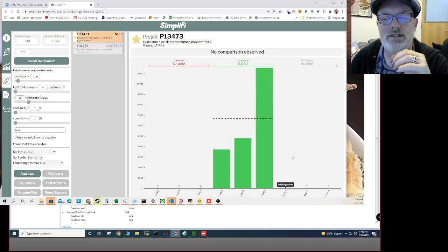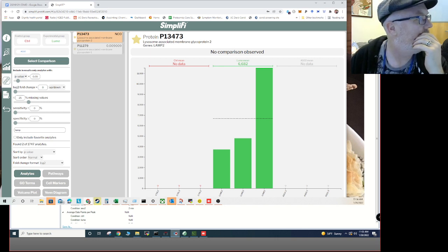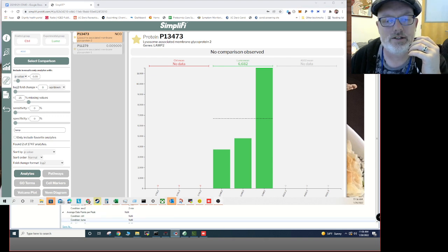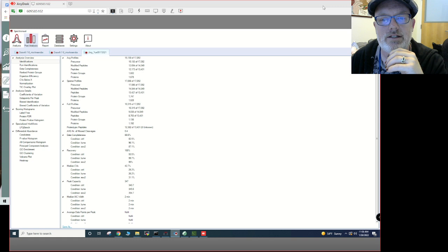Okay, so let's do that, and I am going to switch my main display, window capture. Okay, so now I am switching to the Spectronaut results.